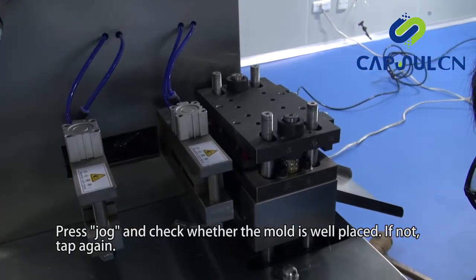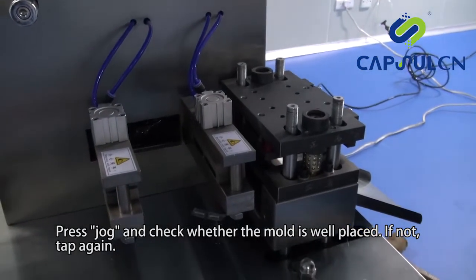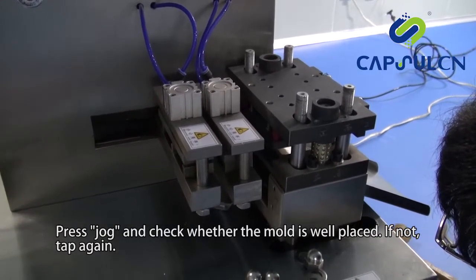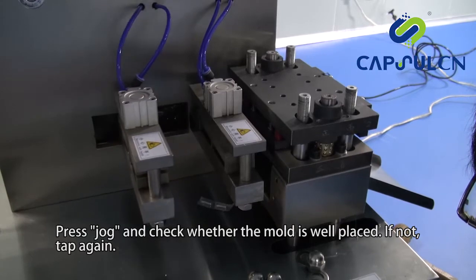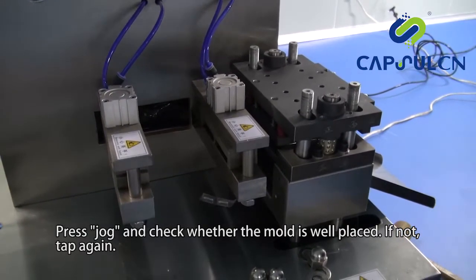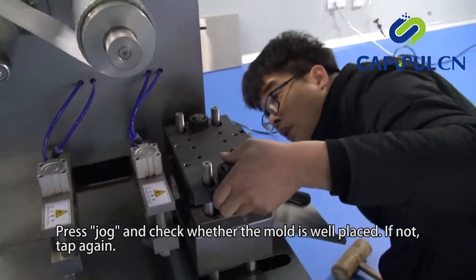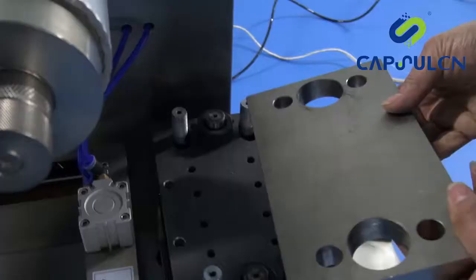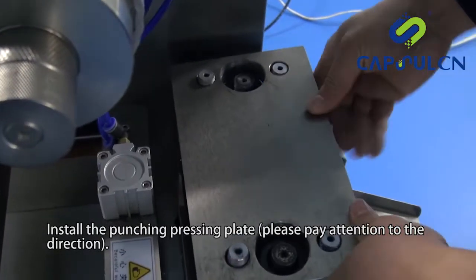Press and check whether the mold is well placed. If not, tap again. Install the punching pressing plate.